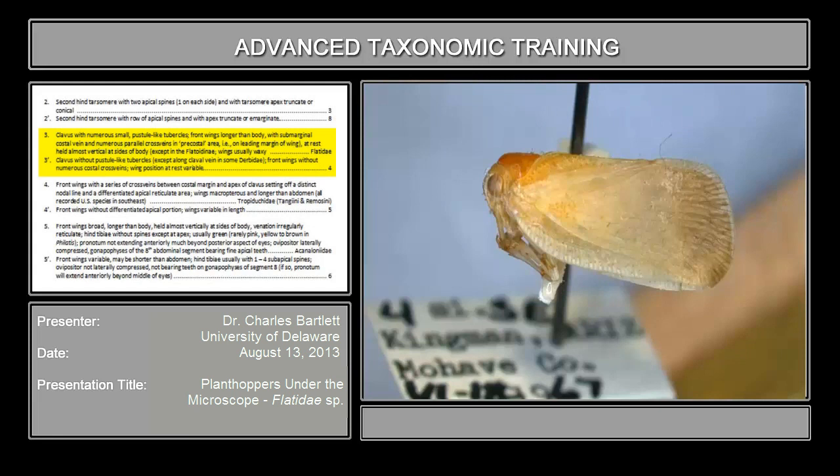The couplet goes on to read that the front wings are longer than the body, which is certainly true. There is a sub-marginal costal vein, and what you're looking for is a vein right along there. That sub-marginal costal vein sets off a series of parallel cross veins. Here's your costal vein along the leading margin, and right in this part of the wing there's a series of small cells. Those cross veins set off a series of cells — that is the feature we're looking for. You have a series of cells in the so-called pre-costal area on the wing.